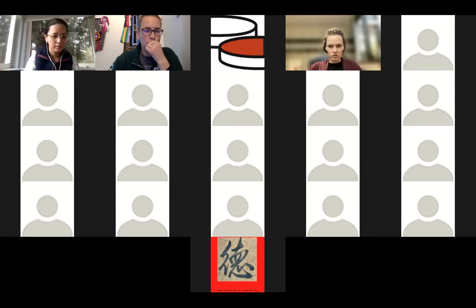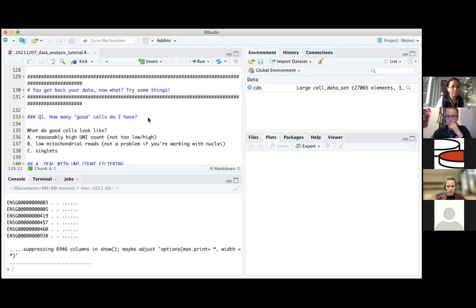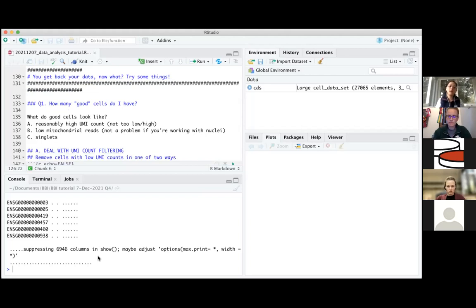Okay. Great. So I'll continue on to the next part. Okay, so now you have your data loaded. Now let's try some things.